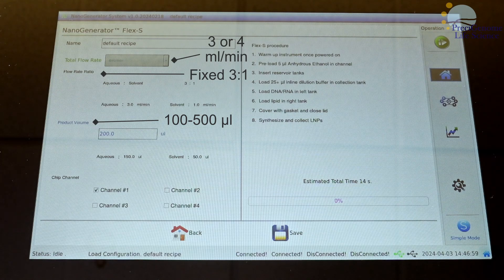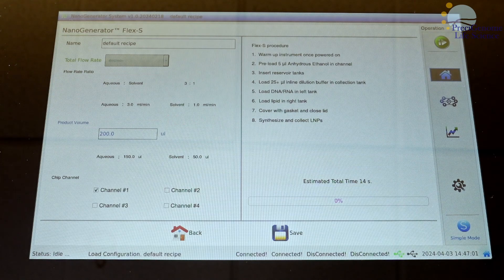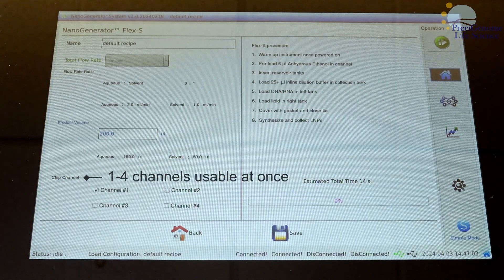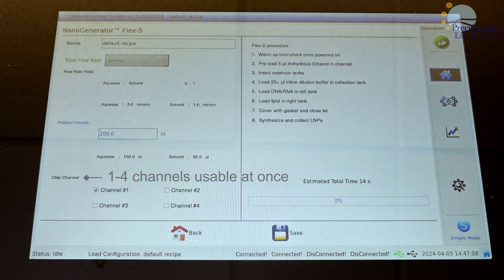For higher volumes, please see our FlexM model. The chip channel may be set to whichever ones are currently active. These channels are numbered left to right in ascending order.